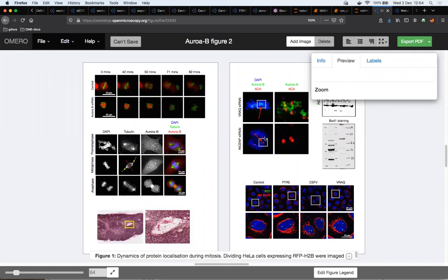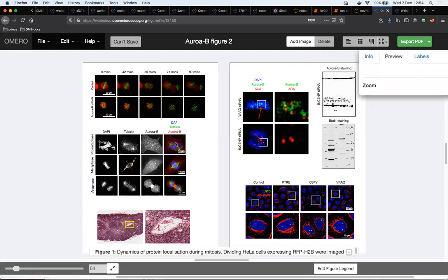And this more or less showcases everything that can be done with OMERO figure. I can create a multi-page figure. I can add a legend here on the bottom. I can draw new regions of interest, such as these arrows here, which were drawn post hoc in figure. This would be on top of those regions of interest, which I showed you how to get from OMERO, which were ultimately coming from the Fiji image analysis. So I can draw such arrows.